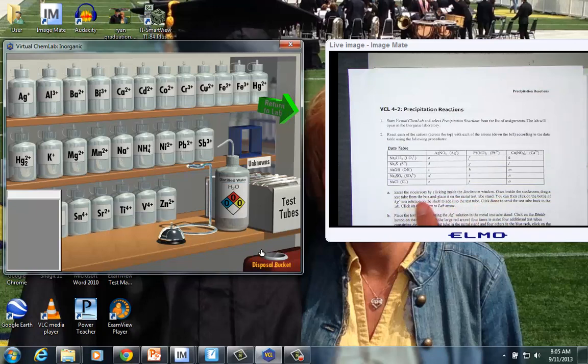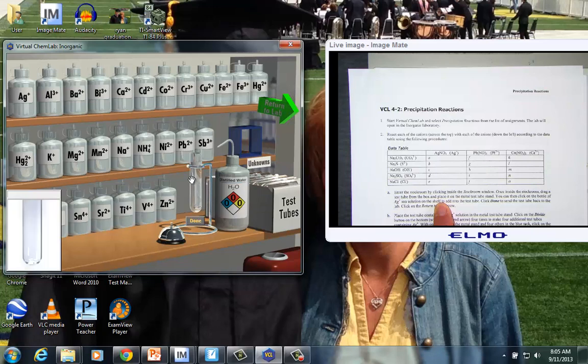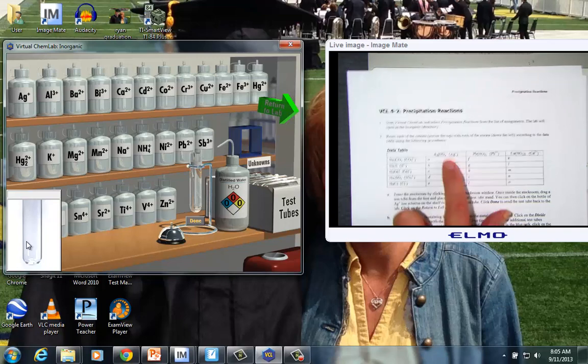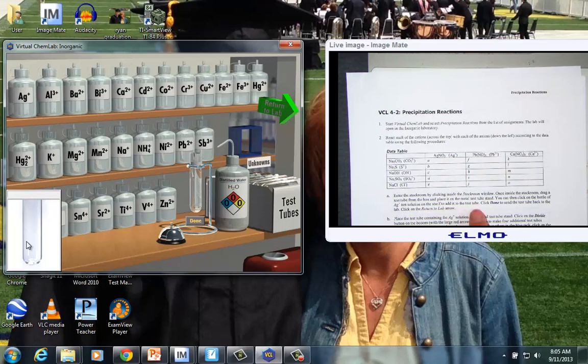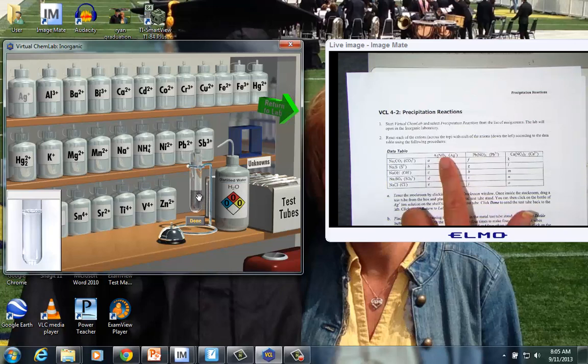And now what we need to do is drag a test tube and place it in the metal stand. So here is the test tube area. If I click and drag it to the metal stand, I now see a close-up. Nothing's in there. You then want to click on, and we'll just pick this first guy, the silver ion in the shelf, to add it to the test tube, and then click done. So what we end up doing is just simply click on the positive. You don't have to click and drag it. You just click it. And notice now that it has a little bit of that silver ion, silver nitrate, sitting in the test tube.